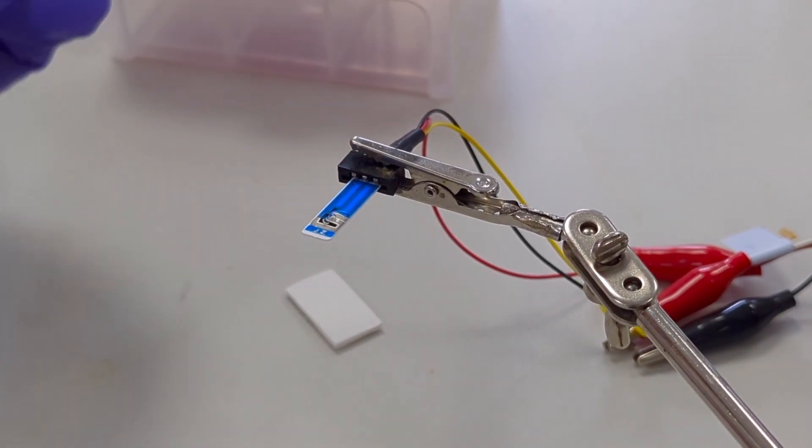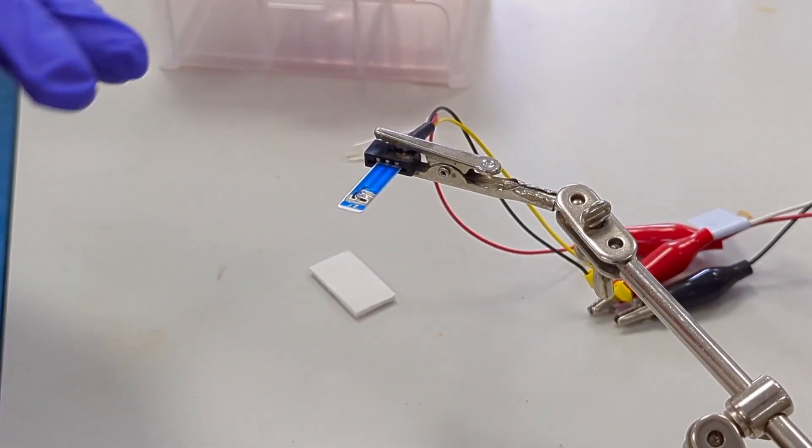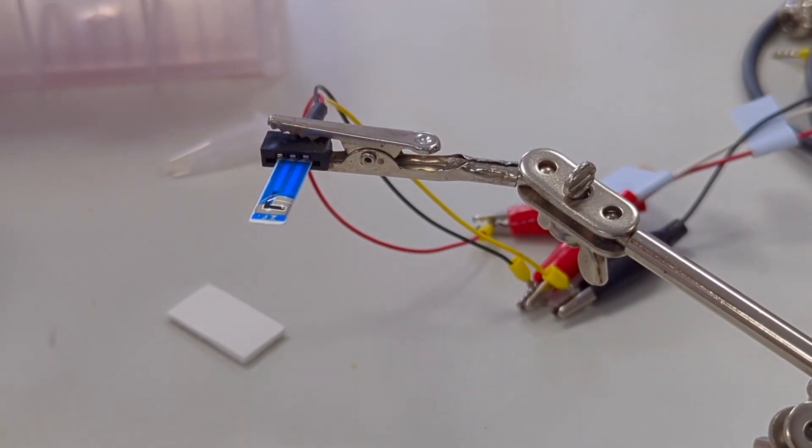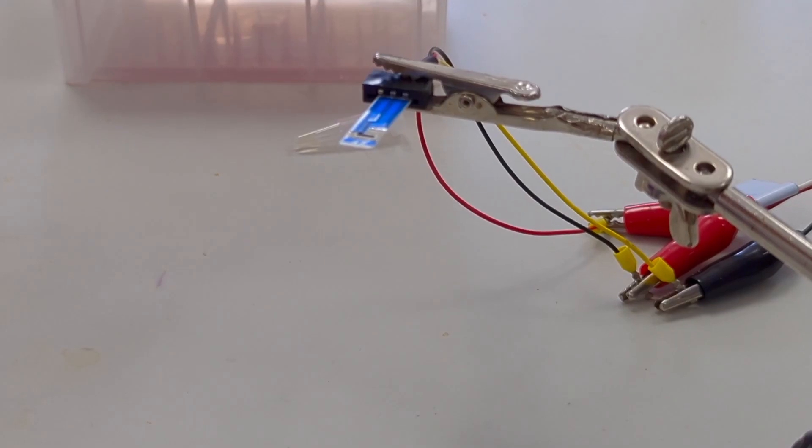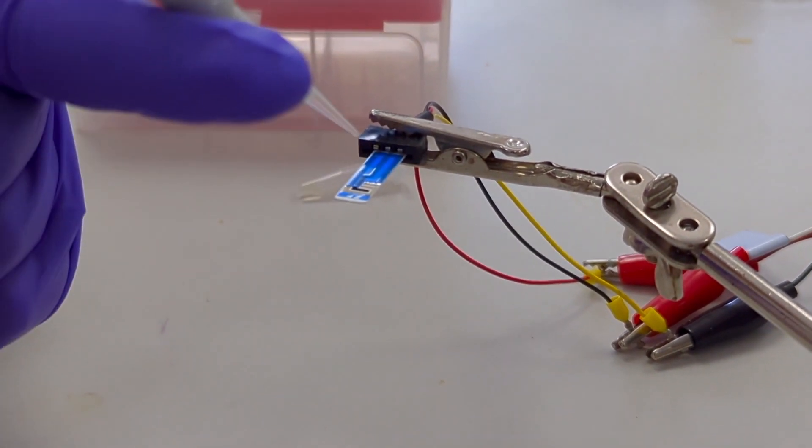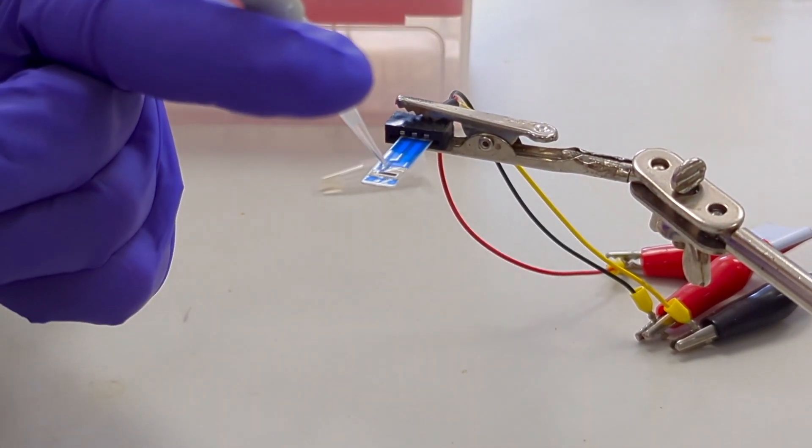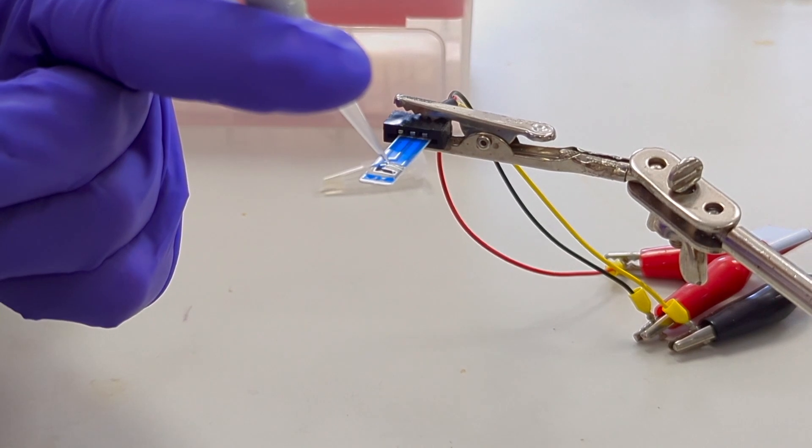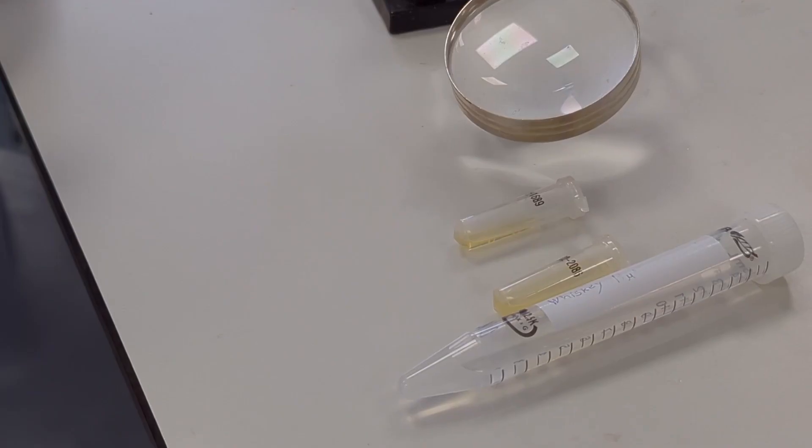Once all the electrodes are covered in the sample, we can then start the electrochemical measurement. Now on a new sensor, I add the same buffer solution to allow the sensor to stabilize while that's happening.